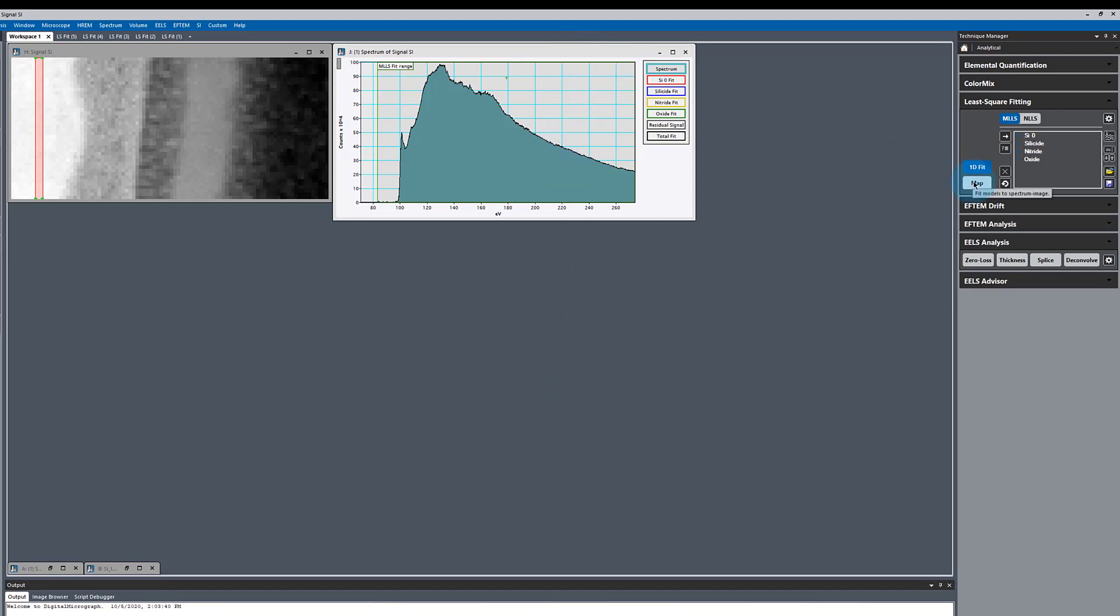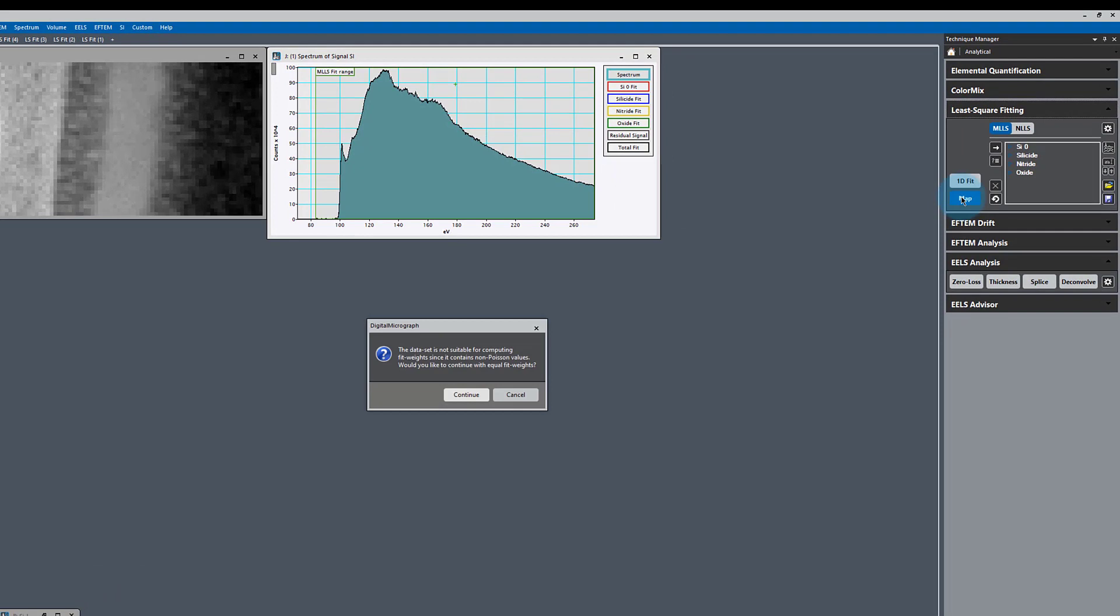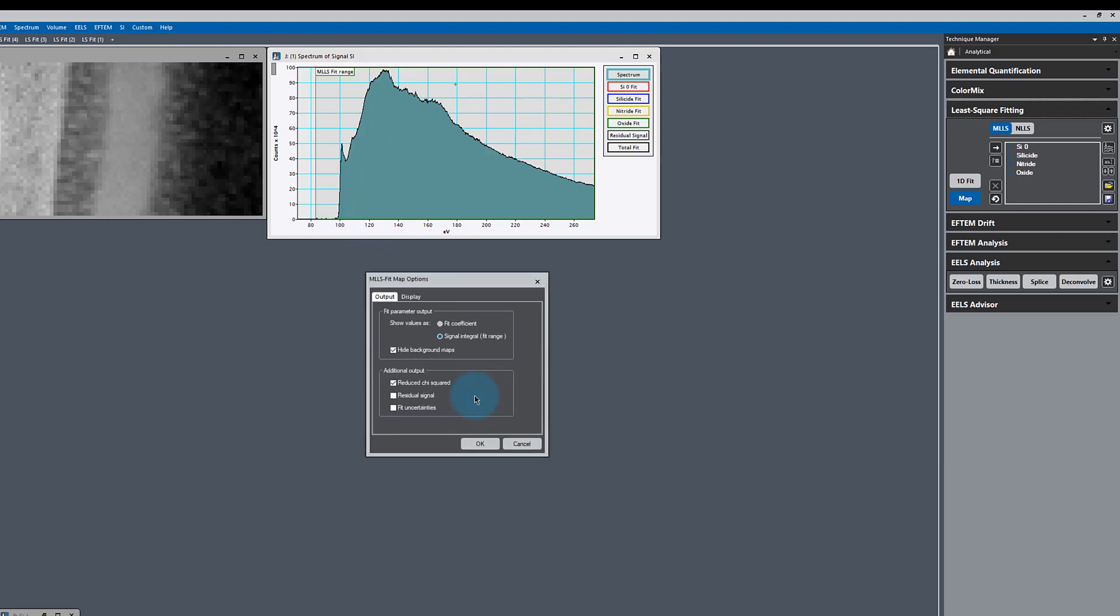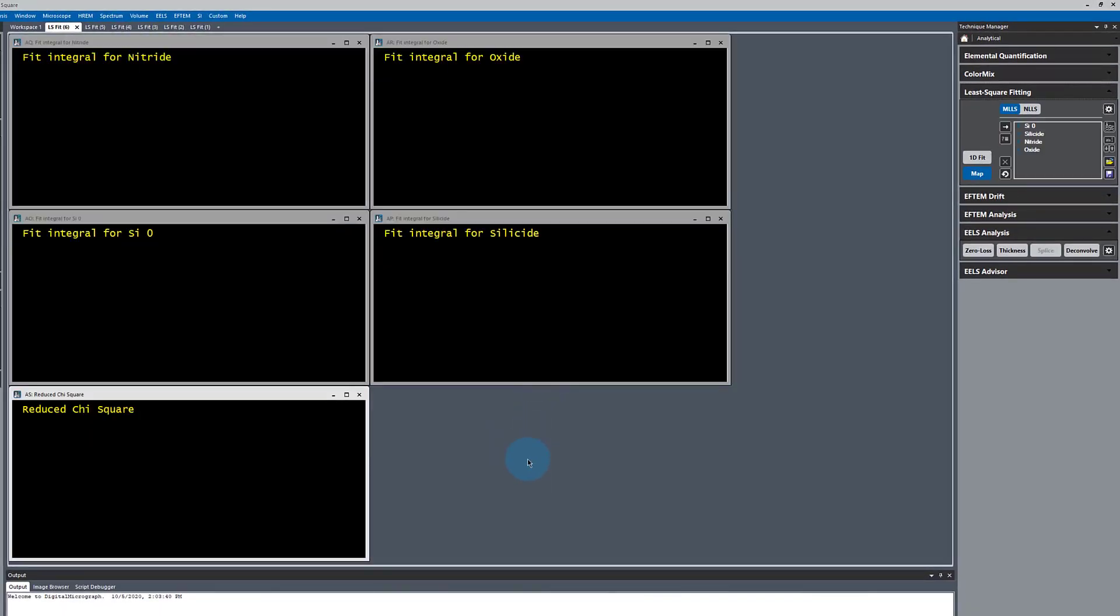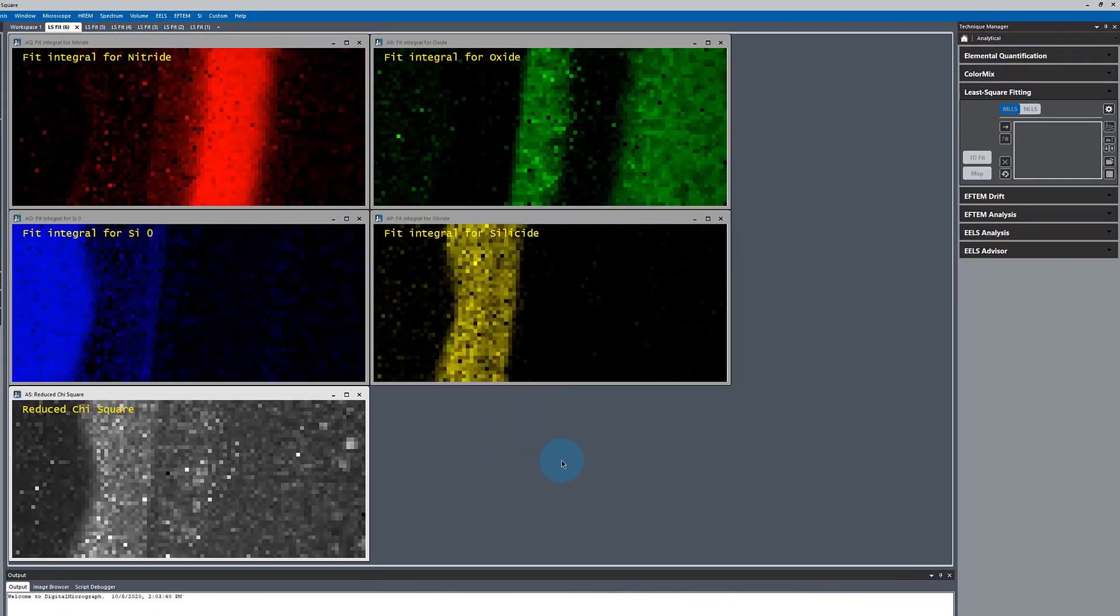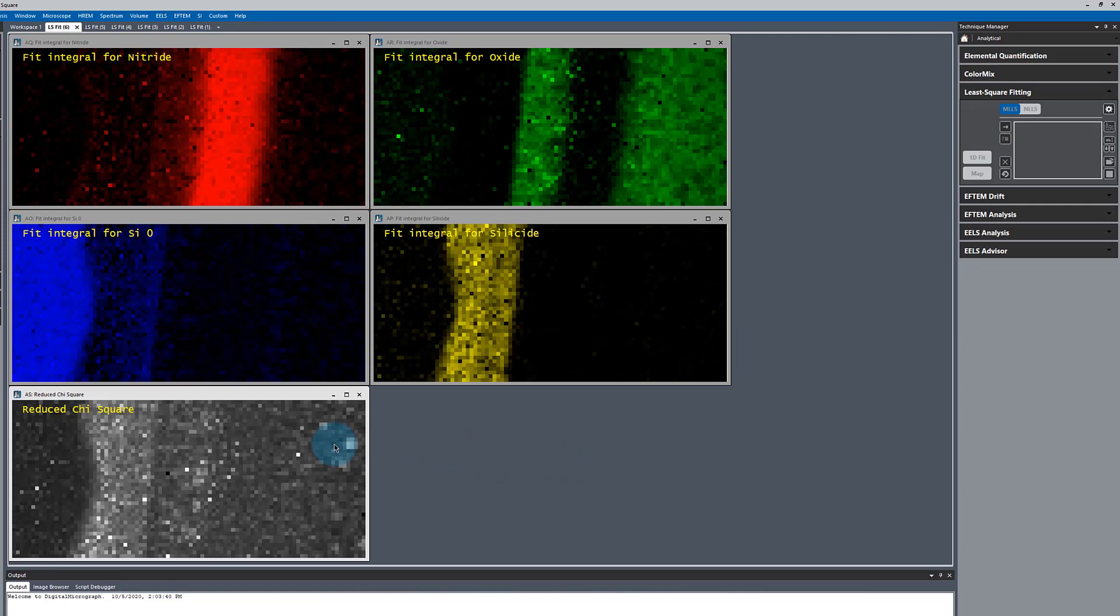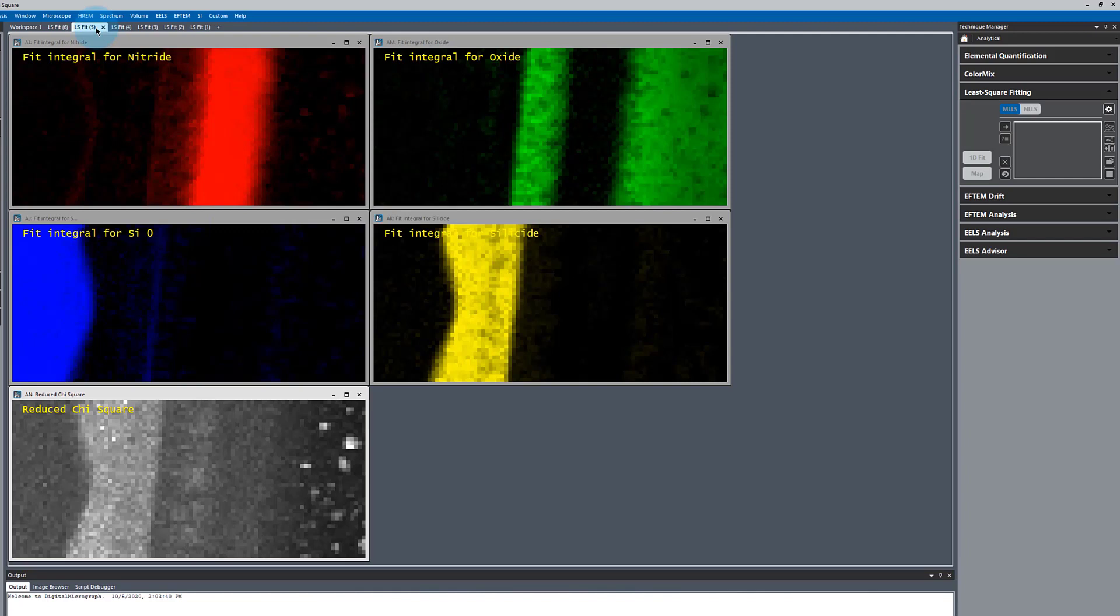When I hit map, it's going to tell us that it could not compute these fit weights. That's because this data has been background subtracted. So the noise on the data is no longer linked to the intensity. Whenever you have a counting problem like collecting EELS electrons, the error should scale like the square root of the intensity. Once we background subtract, that information is lost. You can still continue using equal fit weights. That's the same way that the non-negativity works when it uses equal fit weights. Here you can see it's been able to add some negative values to compensate for the poor fitting in this region. And that is why our non-negativity was much cleaner and gave us a much better data set.